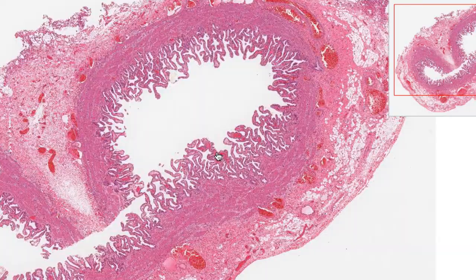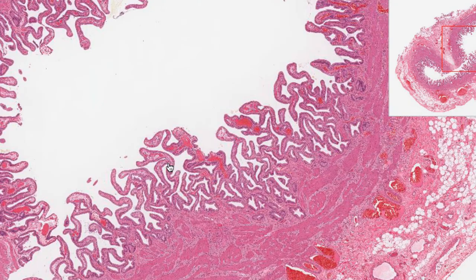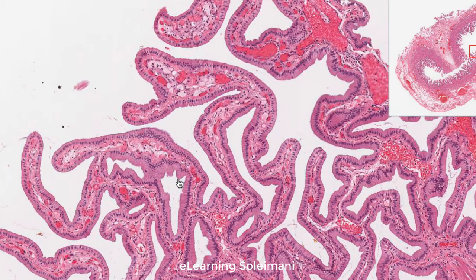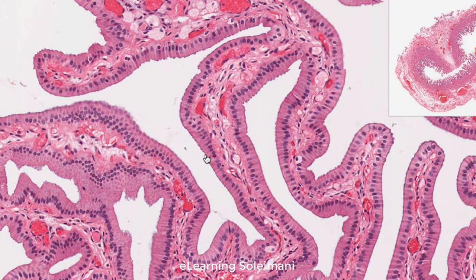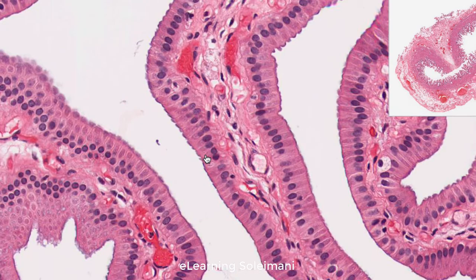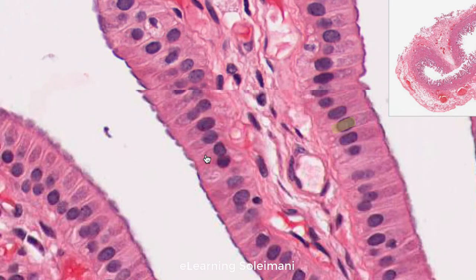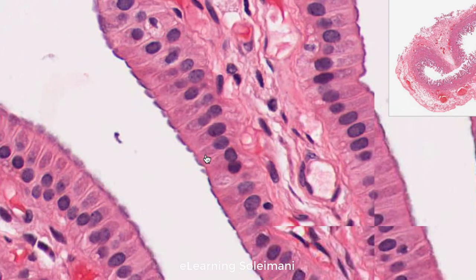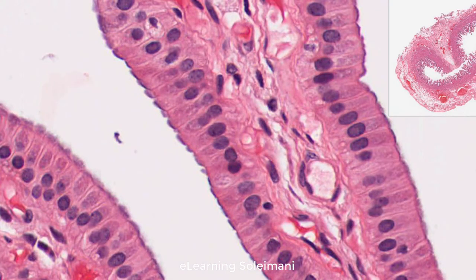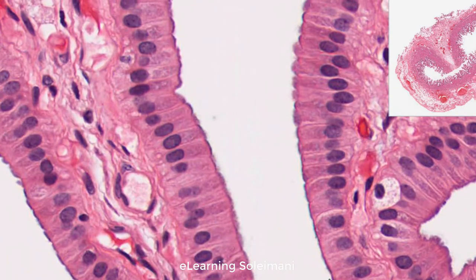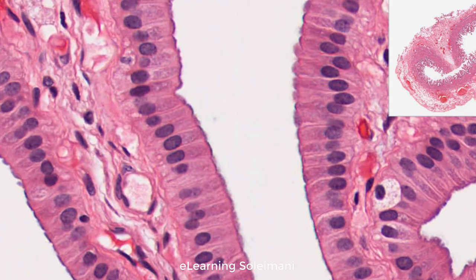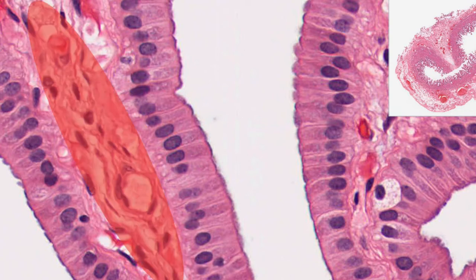The next slide is the gallbladder. Our aim is to describe the simple columnar epithelium. Each cell has more height than other dimensions. Their nuclei are located vertically on the basal parts of the cells. The cells of this epithelium, like others, are anchored on a basement membrane, and the connective tissue is visible underneath it.